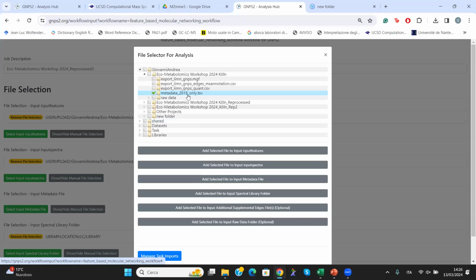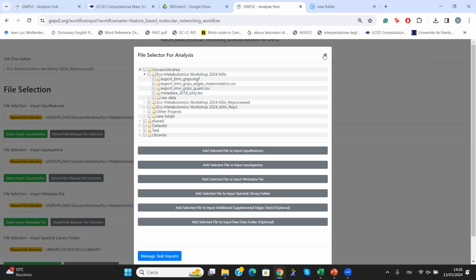So what we're gonna do is to import the metadata here. And then we can close. Is everyone with me? Okay.